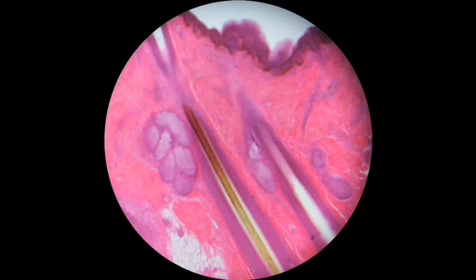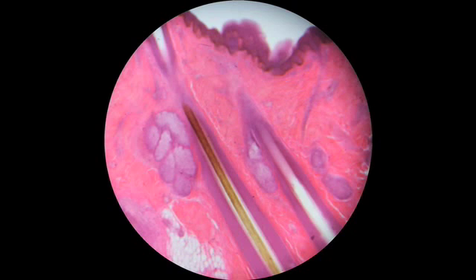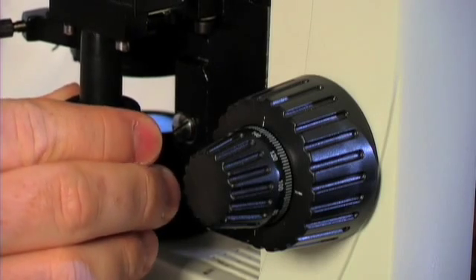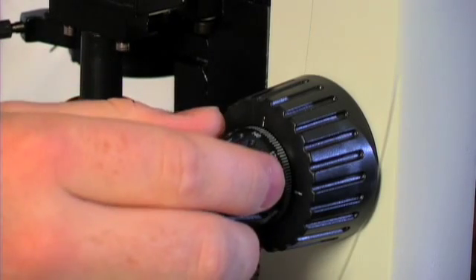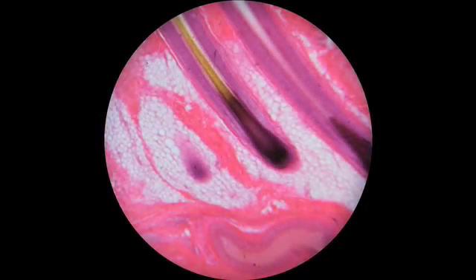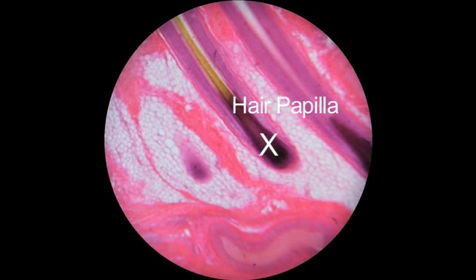Students may be interested to know that the sebaceous gland is involved in acne. Here we see a hair shaft, and in many sections you'll see that the hair shaft extends out from the skin. We can translocate to a different section of the slide deeper than the dermis to see the subdermal structures, including the hair papilla, which is the part of the hair that actually grows at the root.